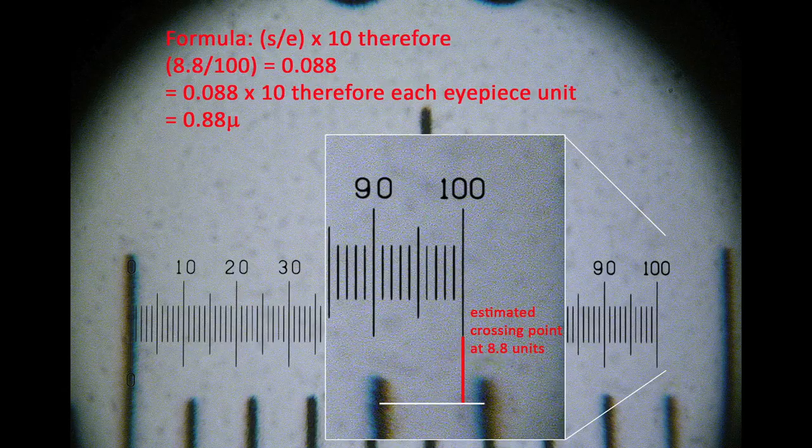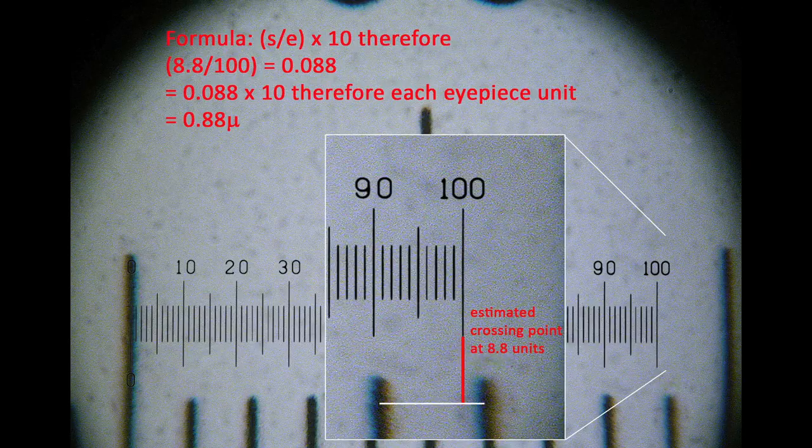What does this mean in terms of actual measurement? I'd go through the film again and make sure you understand each step and why it's necessary. Then we'll have a look at a simple example.